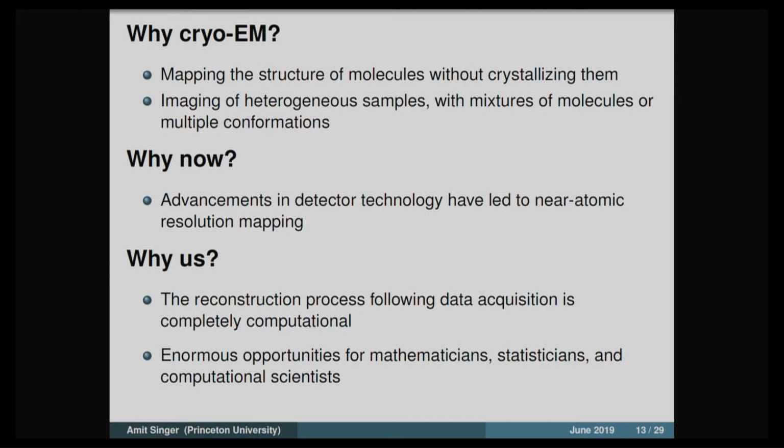So, why CryoEM? If I want to compare it to X-ray crystallography or NMR spectroscopy, one of the main advantages of CryoEM is that it completely bypasses the bottleneck of crystallization. It's a completely general technique. You just need to freeze the molecules in water, if you wish. But there is another advantage: because it's a single particle method, you can see individual particles. In principle, one should be able to also extract what is called conformational variability.